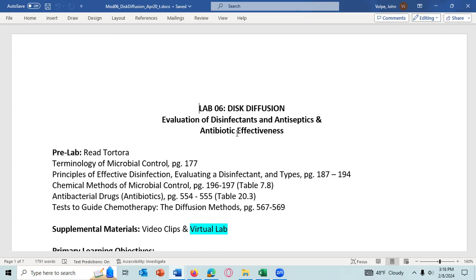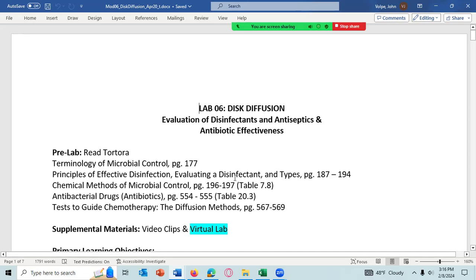So I know that one was one, but anyway, she did get very good results. And how she did that was she brought in those things and then did the Kirby-Bauer method.